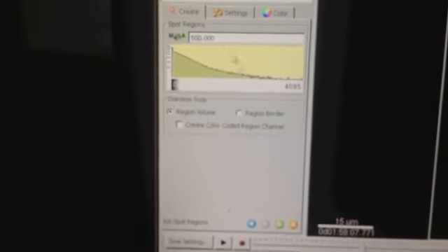Here I normally start at a threshold of about 500. You can see this automatically reduces down, so if I go back to this default, which is 50, you can see that you've got, whoa, lots there, it's too much. So I normally find about 500 is a good way to go. This should bring back down to basically nothing. So you're just staining again the nucleus, and it'll help get rid of any dots.